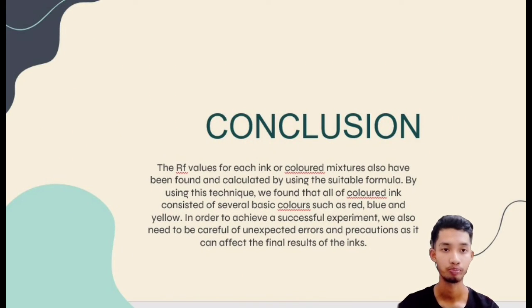In conclusion, the objective of this experiment, which is to separate the mixture of chemical substances, was achieved by using the paper chromatography method. All of the colored mixture samples were successfully separated.